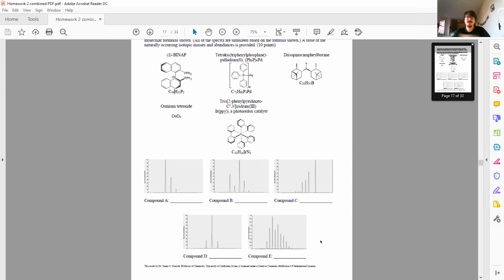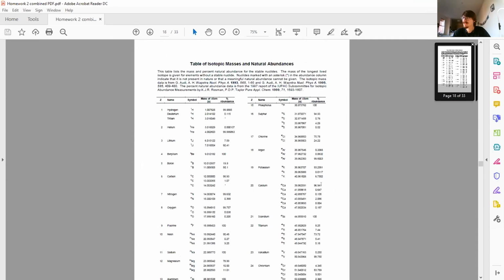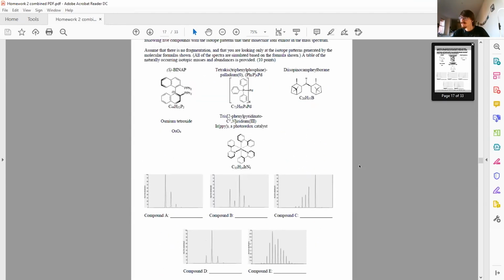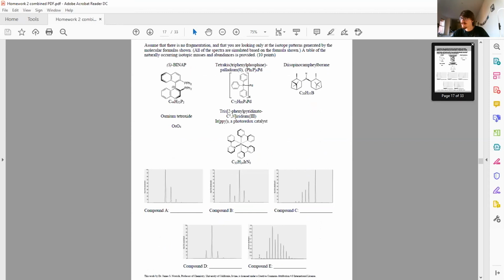What drove you to that conclusion? Palladium has a lot of different oxidation states. So just in terms of language, these wouldn't be oxidation states, but isotopes. The mass is differing based on number of neutrons. But yes, you're correct. This certainly has the largest plurality of different peaks.